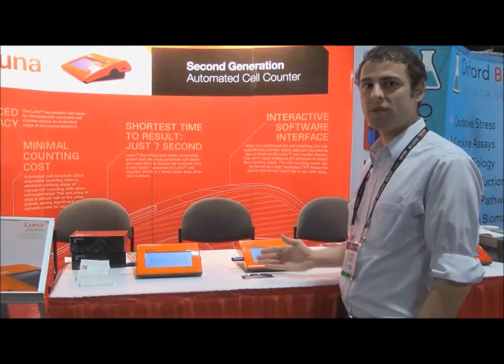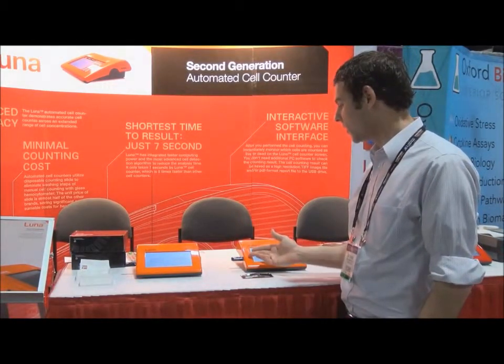After performing the count and any data analysis you choose, you may export your files to the computer using the USB port on the side of the Luna FL.